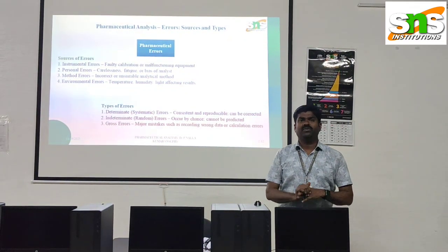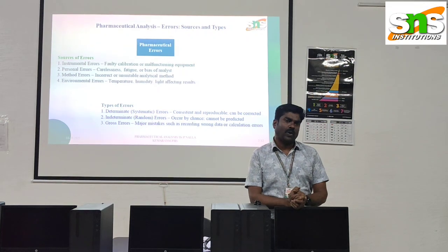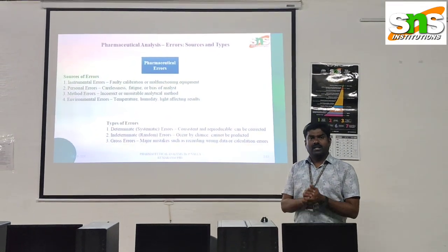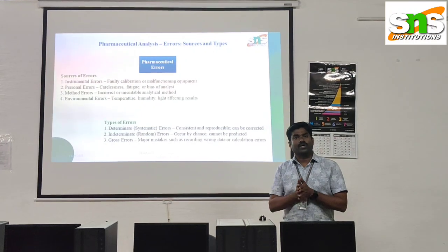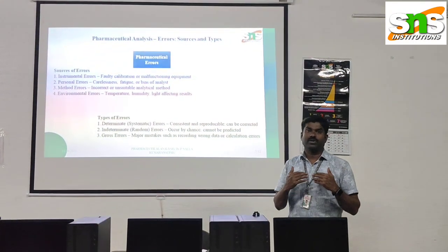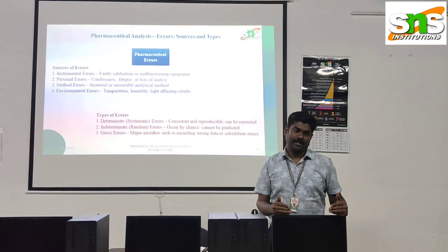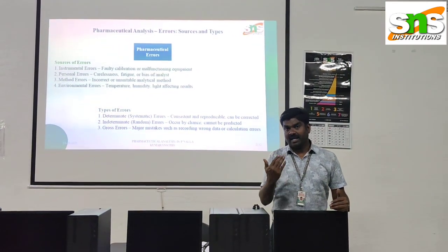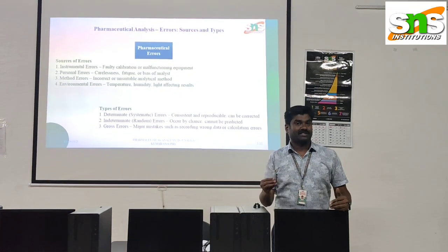We have clearly given SOPs for all the instrumentation. If you have any doubt in my lab, you can ask me. You have to clarify before using the instruments. And these types of personal errors we can avoid with the help of experts.